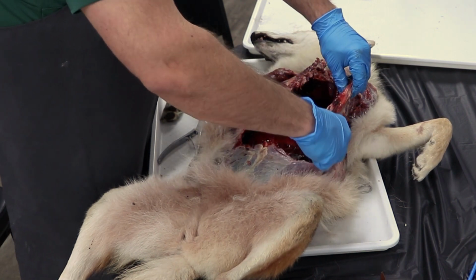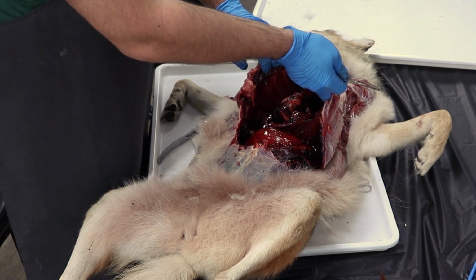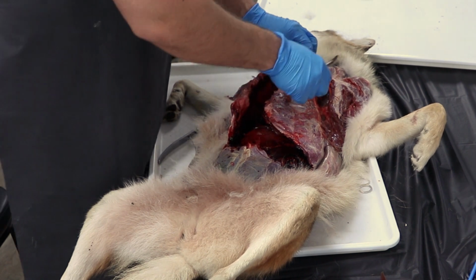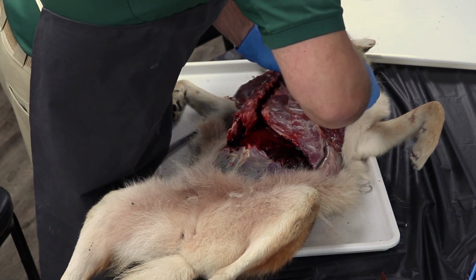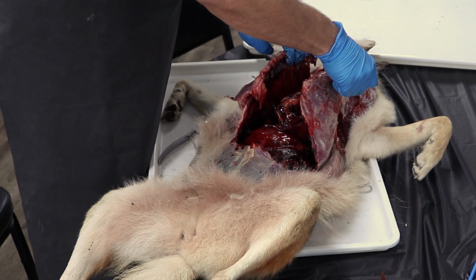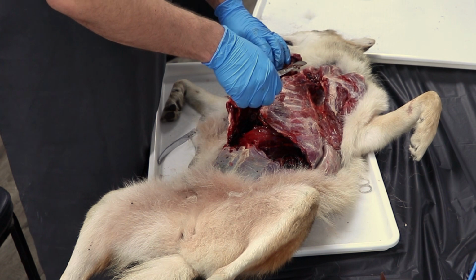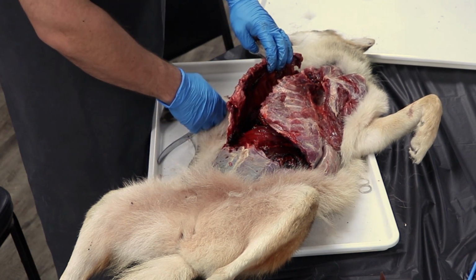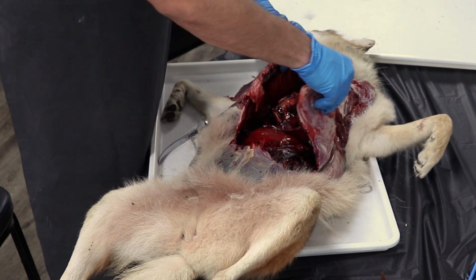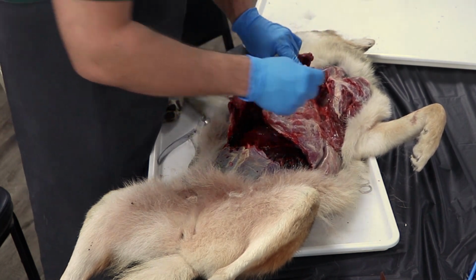Because one of the things that differentiates mammals from most reptiles is that they have much higher energy demands. And so one of the anatomical implications is that in addition to their higher energy demands, they have to have much greater capacity to move oxygen and carbon dioxide around from their cells. That means a more powerful heart that we're about to see, and a whole lot more blood relative to their body size than a comparably sized reptile.